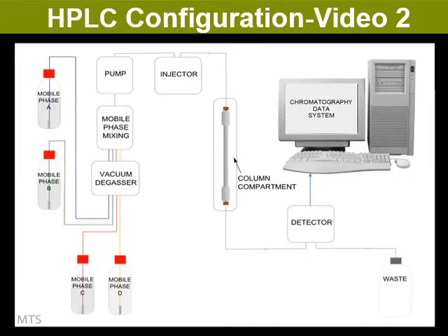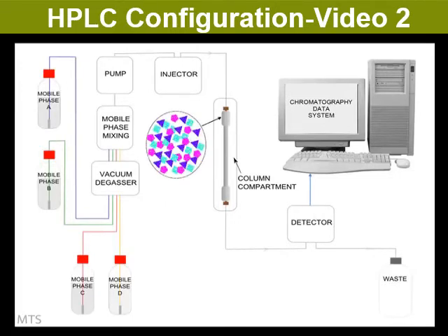So what happens during an analysis? The mobile phase is flowing through the system from the mobile phase reservoir to waste. We will inject a mixture of 3 components, shown here using 3 colours: pink, green and blue. At the head of the column, when the sample first encounters the stationary phase, we have a mixture of all 3 components. The equilibrium between each component, the stationary phase and the mobile phase is different for the 3 colours in the mixture. In our mixture, the pink component spends more time in the mobile phase relative to the green and the blue, and travels through the column quickest.